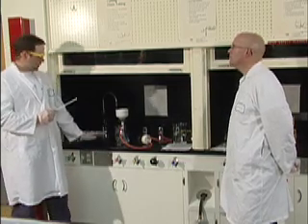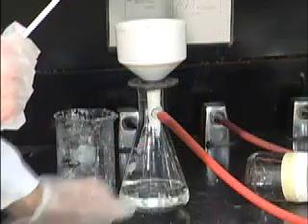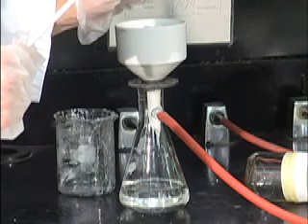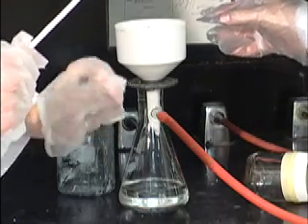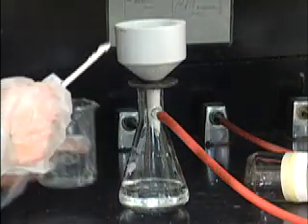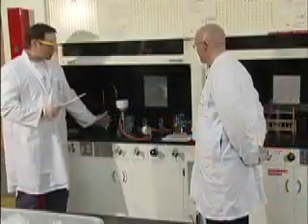However, sometimes not all the crystals have formed yet, so you will get some crystals forming in the bottom of your funnel. What you want to do is take the fluid from your funnel, put it in a beaker, and refilter it over your crystals again. So if it stops dripping here, I can just put that over another beaker. Pour this stuff into another beaker and then pour it back in. Exactly. And actually a really good beaker to do that with would be the one we just took the crystals out of. Okay. So if there's any other questions, I think that's about it.